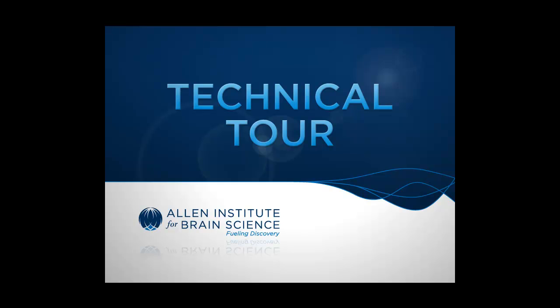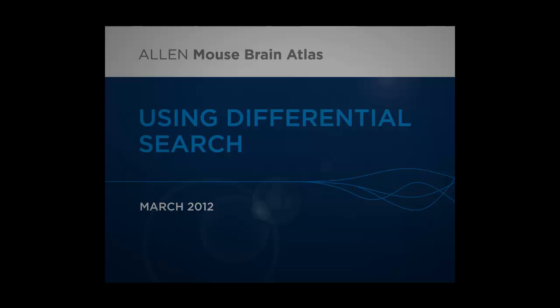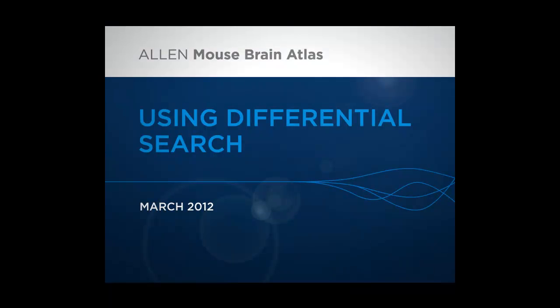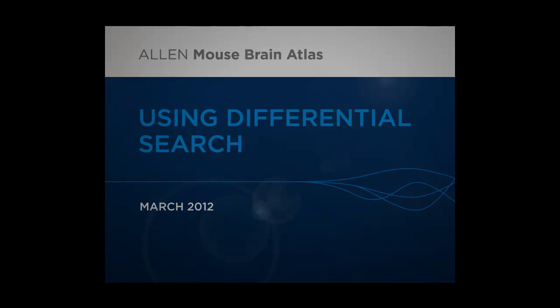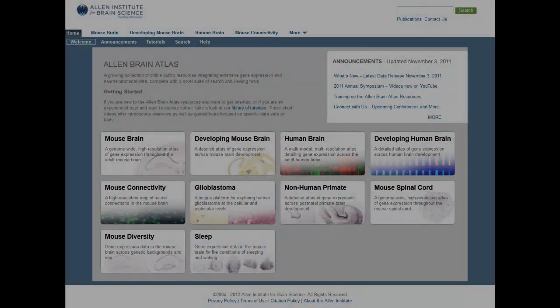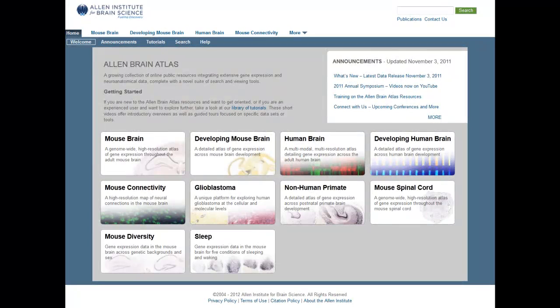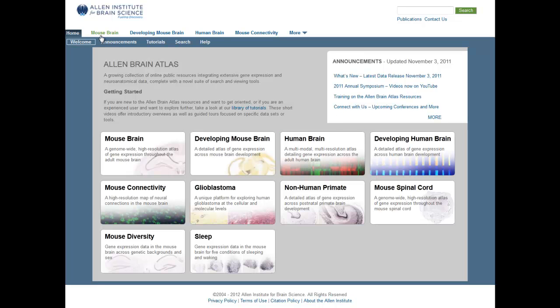Welcome to the Allen Institute for Brain Science Technical Tour. This video will demonstrate how you can use the differential search tool to find gene markers for specific regions of the brain and visualize this gene expression in three-dimensional space. While I'll be demonstrating the differential search from the Allen Mouse Brain Atlas, we also have this feature in the Allen Developing Mouse Brain Atlas and the Allen Human Brain Atlas.